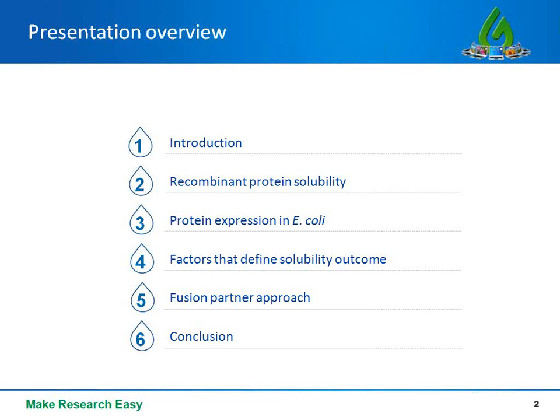We can take a look at a typical E. coli protein expression workflow, and then look at some of the key aspects of E. coli expression, and what you need to consider before embarking on a protein expression project. We can focus on concerns and aspects of E. coli expression, and look at the solutions that GenScript has come up with to address some of the challenges.